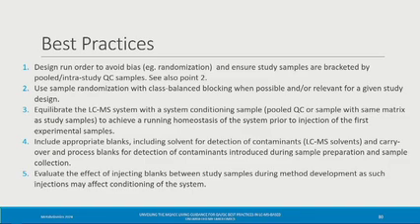deviated metabolomic profile or high drug. If you don't wash your column enough or you don't equilibrate enough, so that it's not in the same condition before every sample, then I think the data analysis becomes much more complicated and you can extract much less from your data. So maybe in the best practices, the blank should not be influencing. If you inject the blank in the middle of the sequence, you should not influence the intensity of the other samples. Thank you.